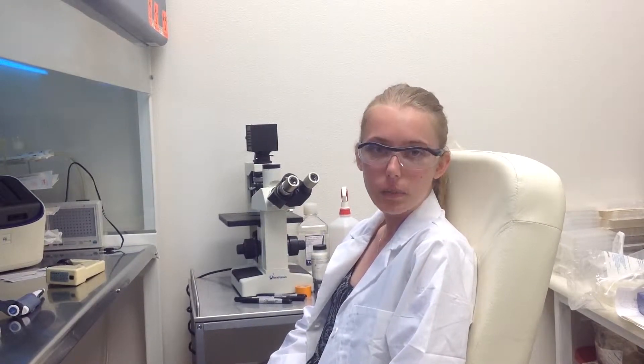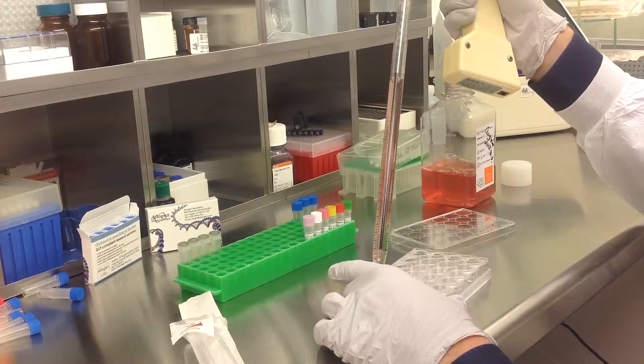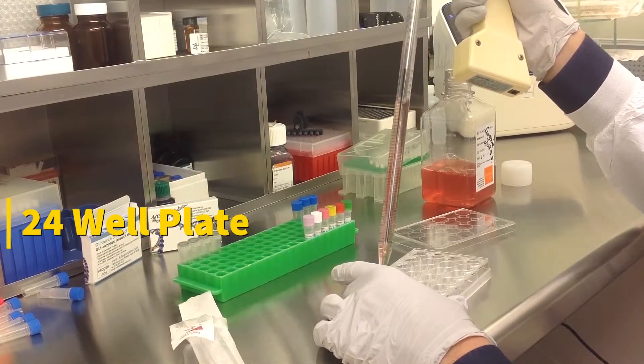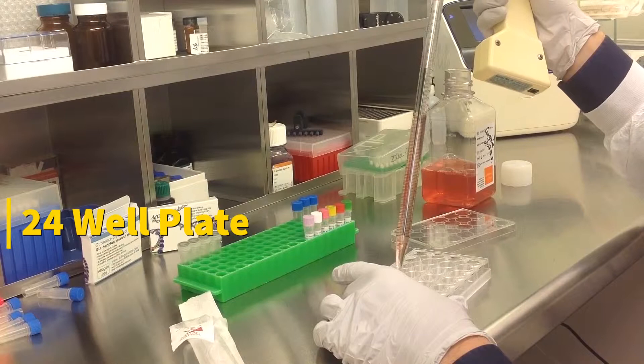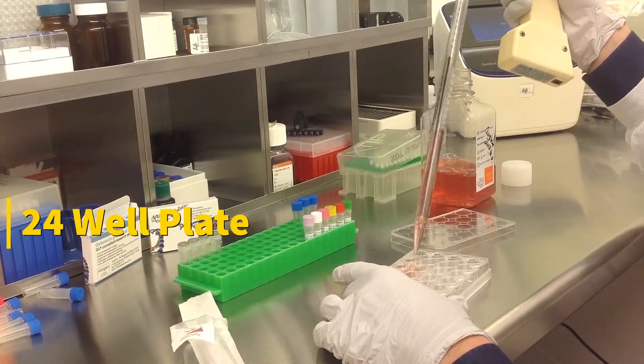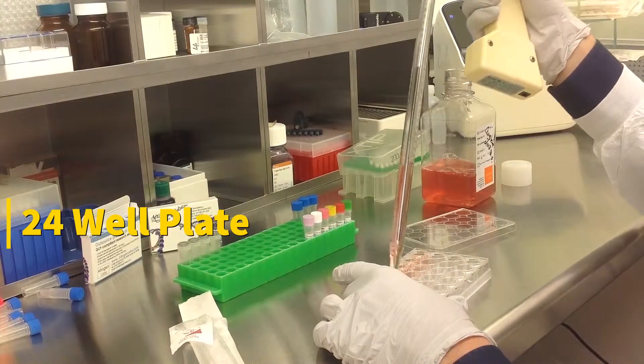Today we will be transfecting IMR-90 cells obtained from ATCC, using a transfection kit manufactured by Altagen Biosystems. In this tutorial, we use a 24-well plate. Transfections can be scaled up or down based on plate surface area as described in the corresponding transfection protocol, which can be found at altagen.com.